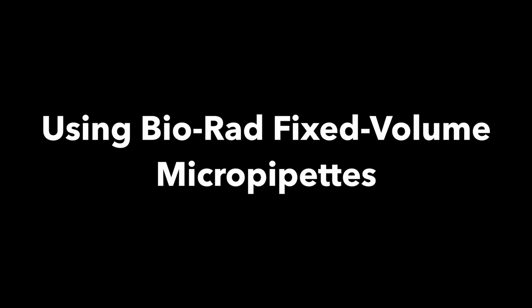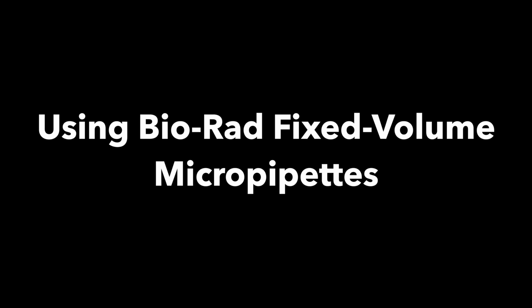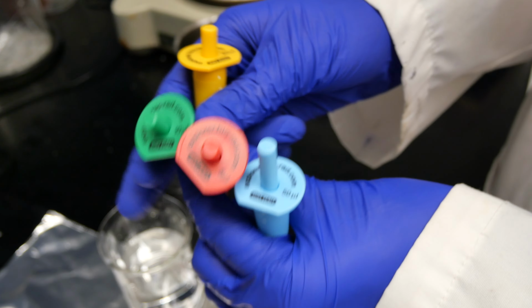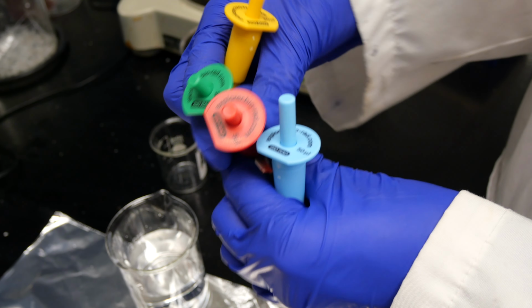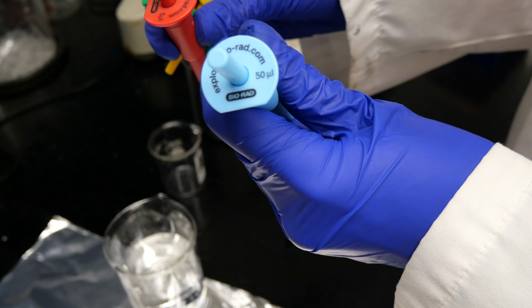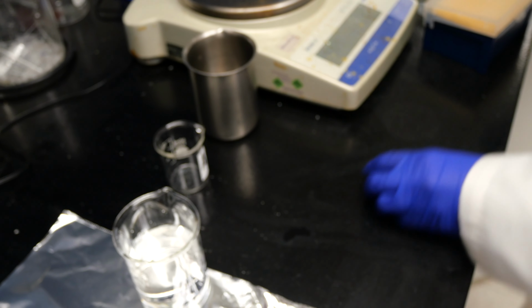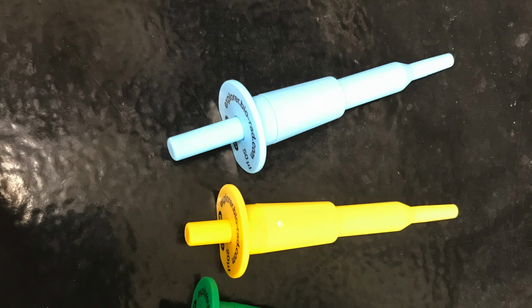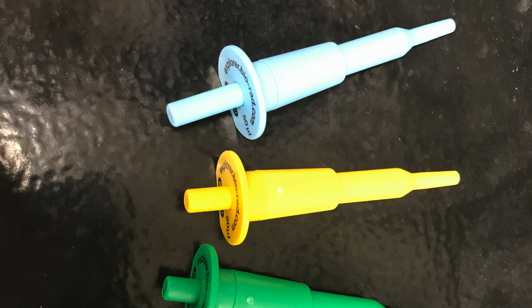Using Bio-Rad fixed volume micropipettes. Here I'm showing 4 fixed volume micropipettes with volumes of 5, 10, 20, and 50 microliters. Every time you use these, it will always be that exact volume, and you don't need to calibrate them.